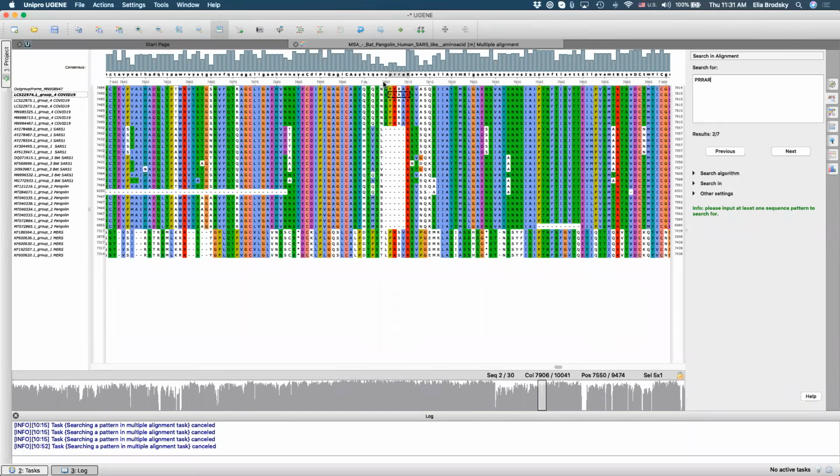So what we see here is the amino acid position on the whole genome, but to find it in the protein sequence is actually not going to be as easy as it seems. Part of it is because we don't have that sequence. It was cleaved off when that structure was created. But what we can look for is this sequence right here, QT-QTN.